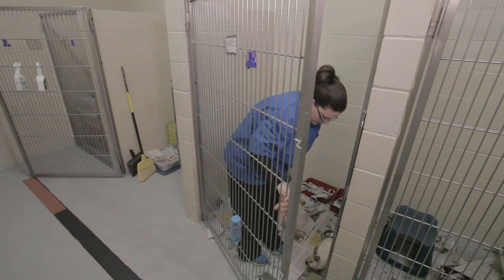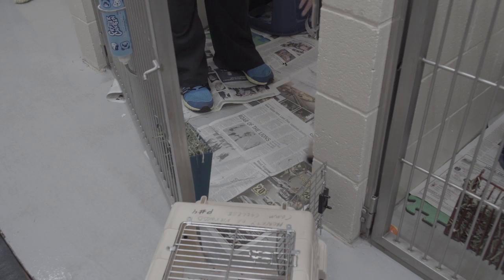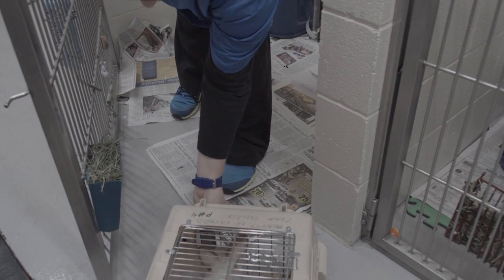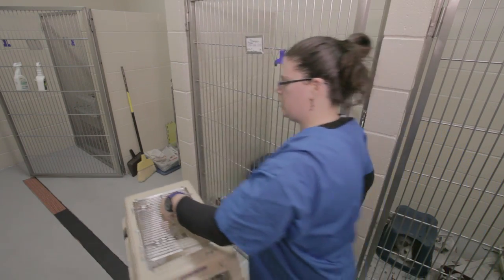Come on, bunny. Come on, Thumper. Come on, good boy. And just set him off to the side while the process continues.